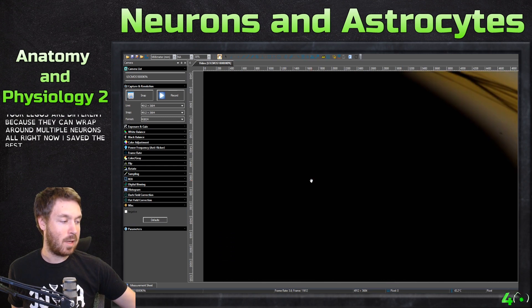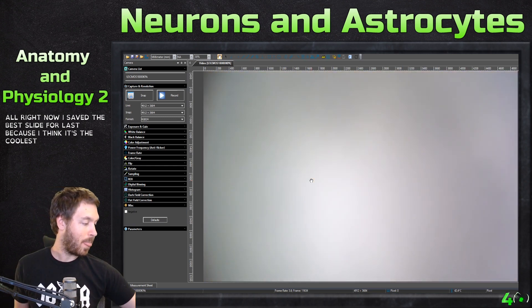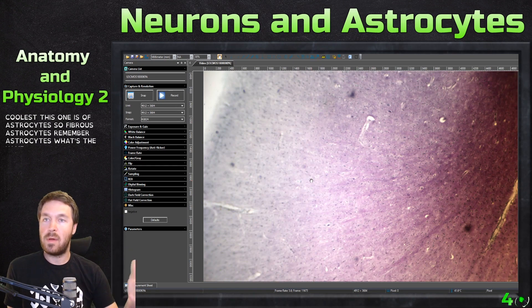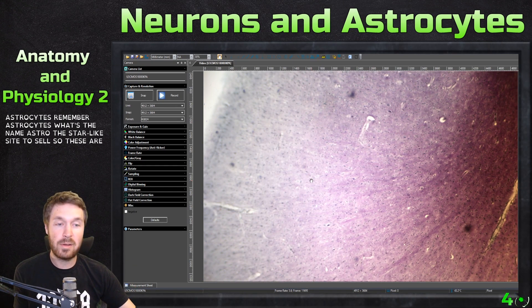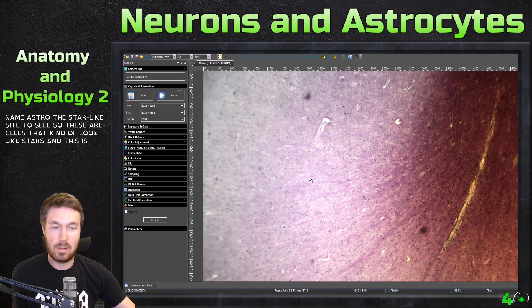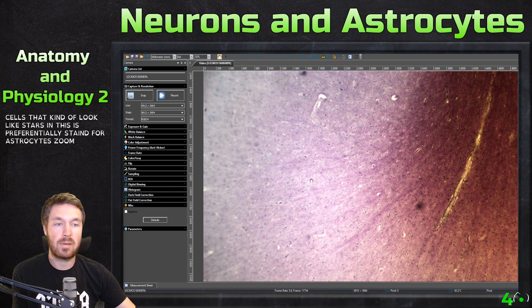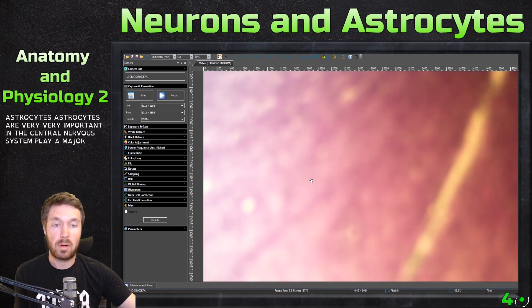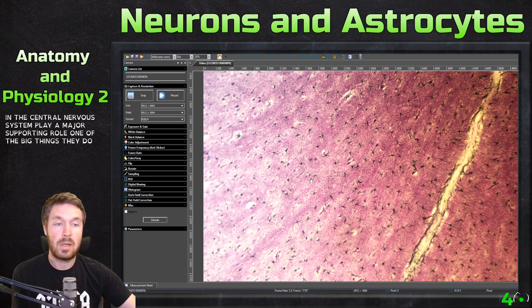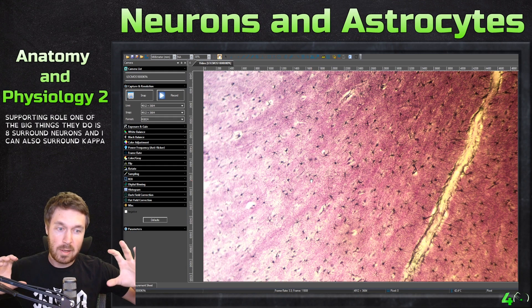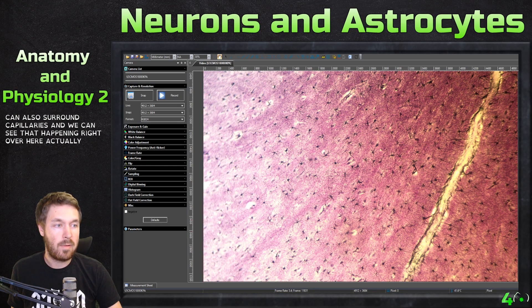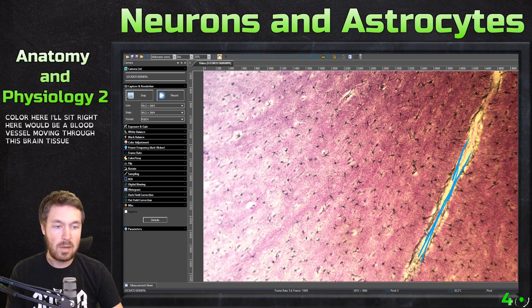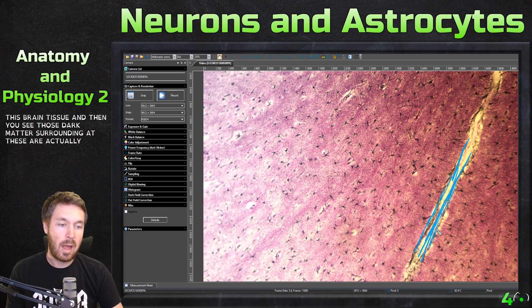Now I saved the best slide for last, because I think it's the coolest. This one is of astrocytes — fibrous astrocytes. Remember, 'astro' is star-like and 'cyte' is cell, so these are cells that kind of look like stars. This is preferentially stained for astrocytes. So let's zoom in. What are the functions of astrocytes? Astrocytes are very important in the central nervous system and play a major supporting role. One of the big things they do is surround neurons and also surround capillaries. We can see that happening right over here — right here would be a blood vessel moving through this brain tissue.